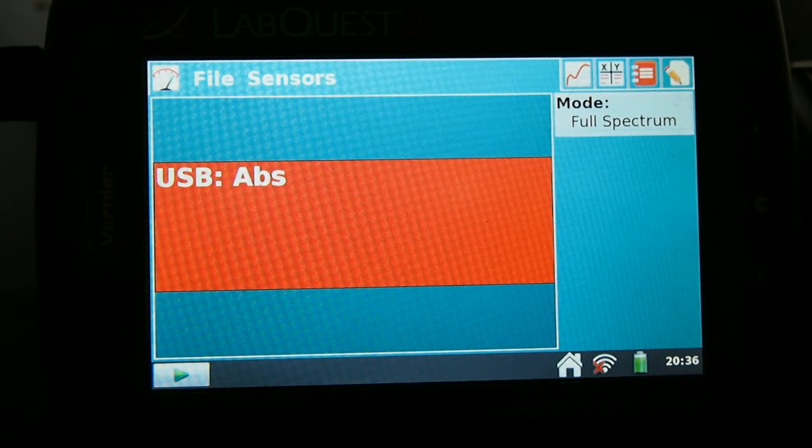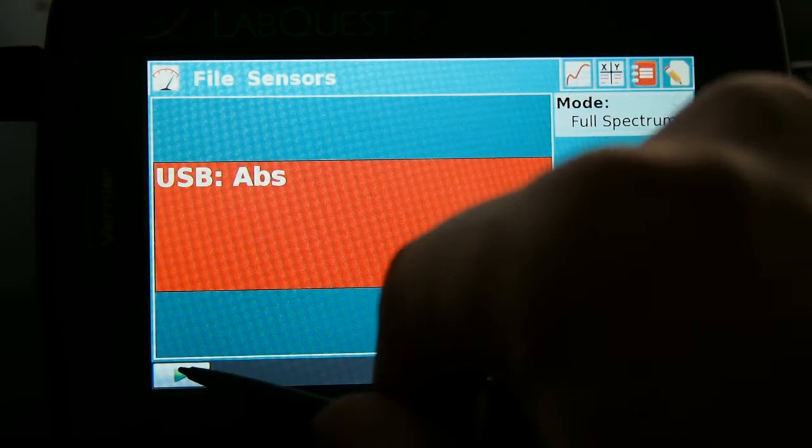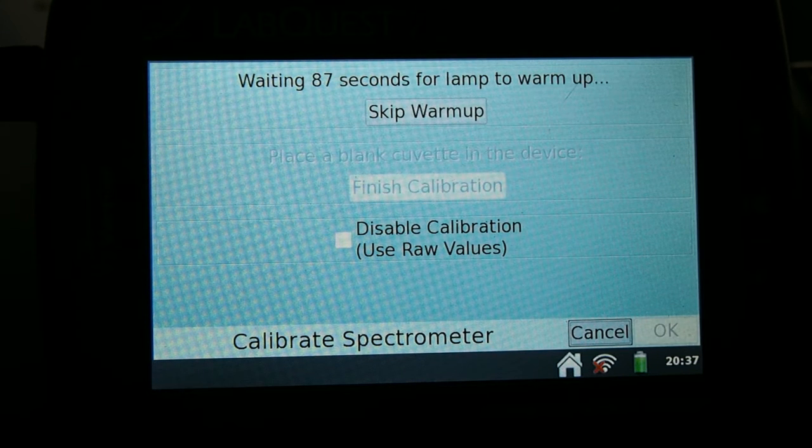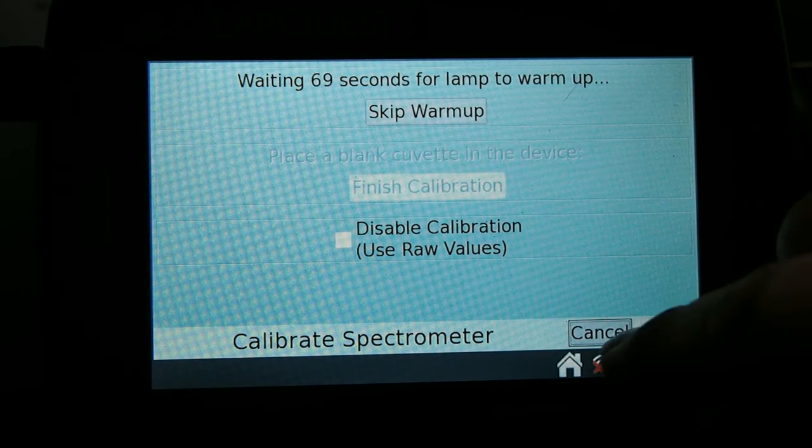Now we're going to wait for the setup method. We're going to have to warm up the machine, so please press onto the green start or play button in the lower left corner. Once we do that, it'll ask us if we want to calibrate the spectrophotometer, so we will press OK.